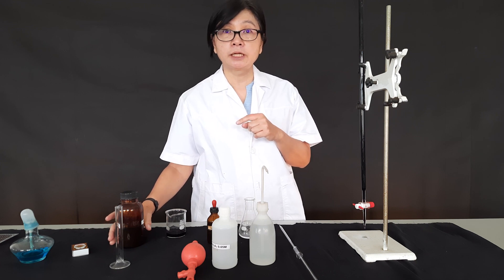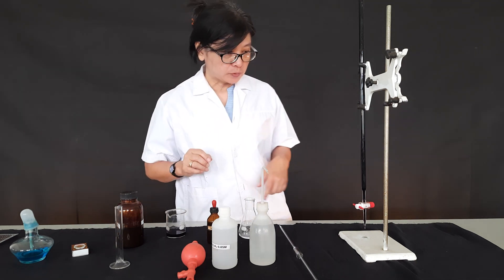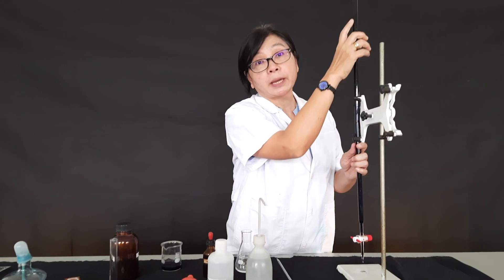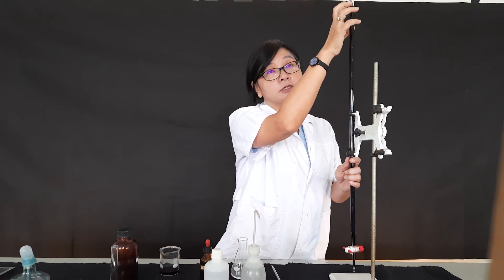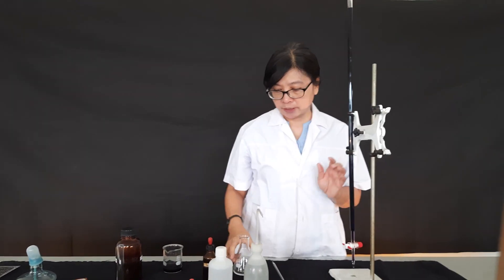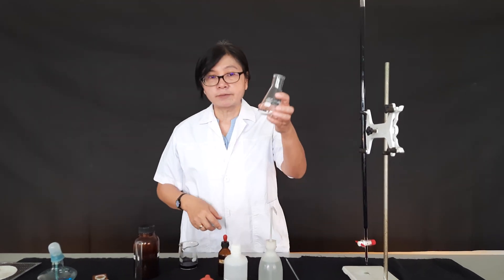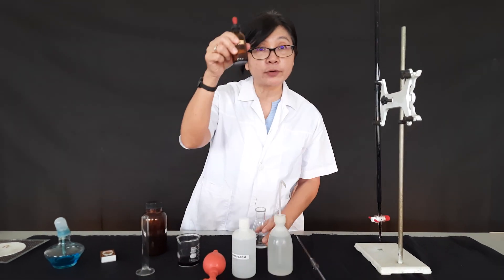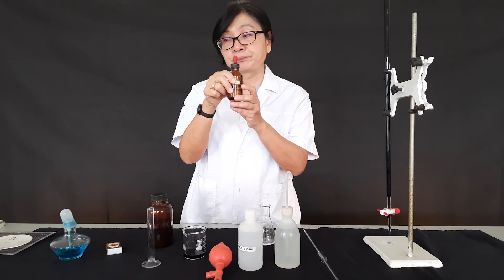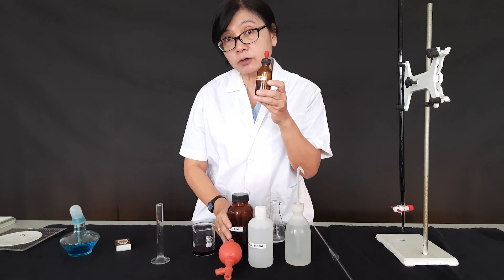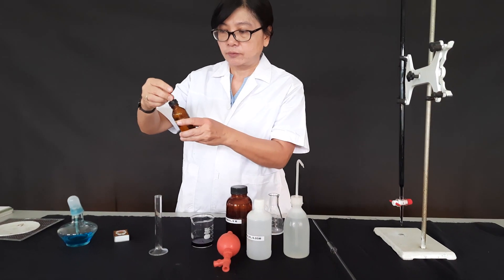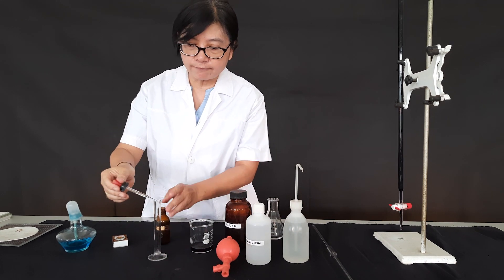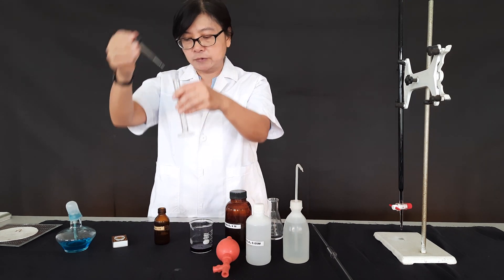I have already filled the burette with the KMnO₄ solution up to the zero line, and I have the oxalic acid solution in the conical flask. Now I want to add sulfuric acid to provide the acidic condition. I need around two and a half cubic centimeters.